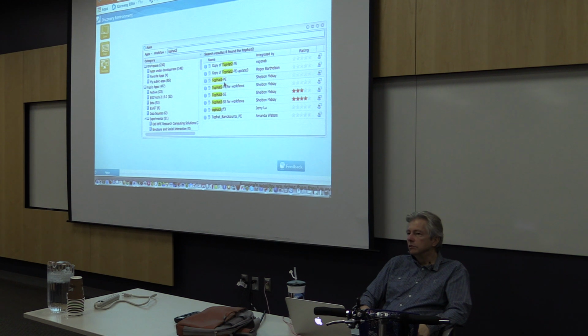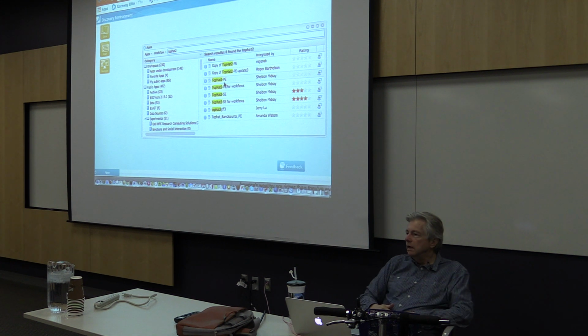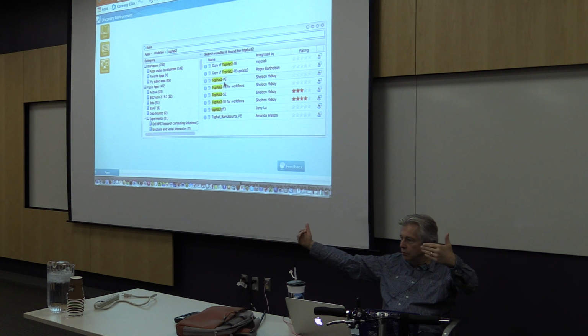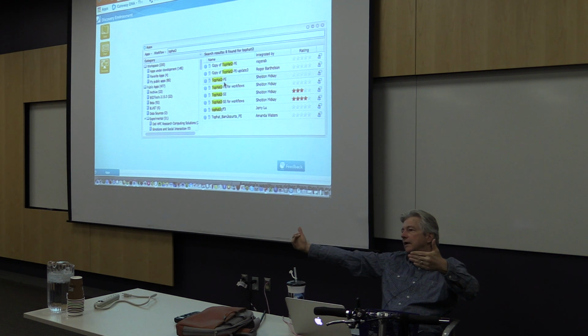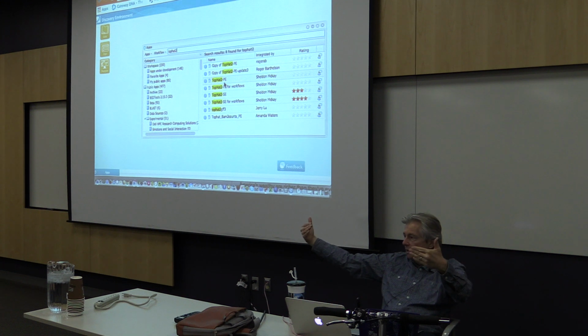And that information is preserved, and the value in that is, depending on your spacing, and that's the simplest case. There are different ways of actually accomplishing this. But in the end, what that means is you have, even if your read is only this long and your piece of DNA is this long, information that says these two were on the same piece of DNA. And since that was on the same piece of DNA, it was one piece of RNA. It was this long, and it had this sequence at this end and this sequence at that end. You don't know necessarily what's in between, but you know that these pieces are related, and you can tie them together in the assembly process.